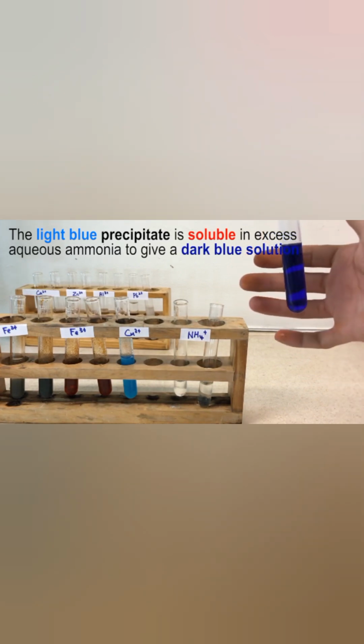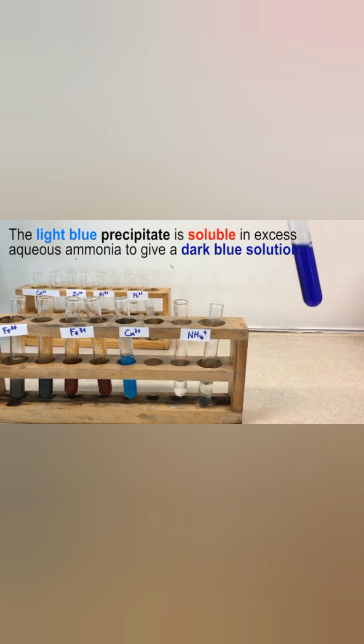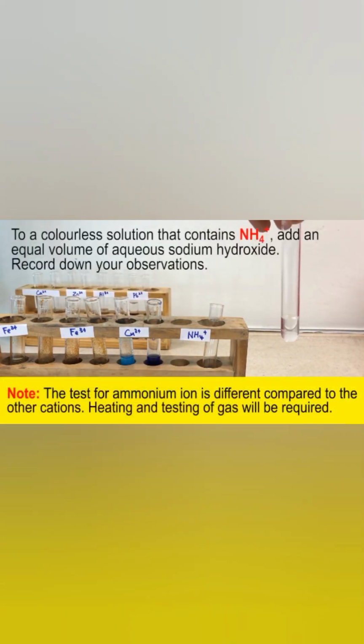Look at it, it dissolves. The light blue precipitate dissolves to give a dark blue solution.